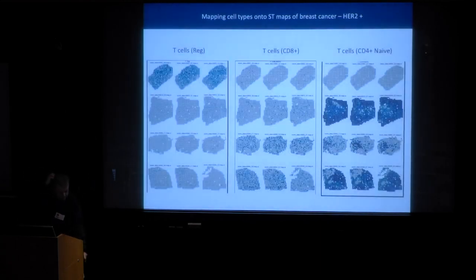A challenge, as I mentioned earlier on, is tumors. It's extremely challenging because you have large patient-to-patient variation. And we definitely need new tools here to better understand this. So this is just an example. These are where we have triplicates of 4 patients. We're looking for T cells. Where are they present? The more blue indicates the presence of those cells. And you could actually see a very wide variety in the presence of these cells. And there is much work to do. And I'll come back to this later on, actually.